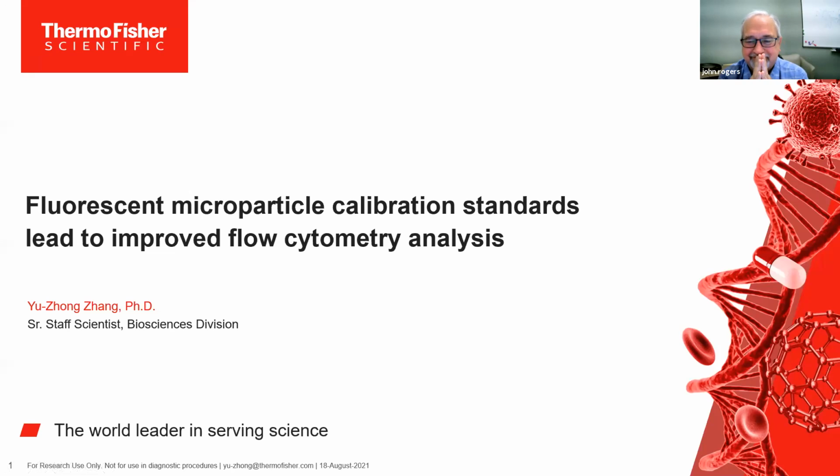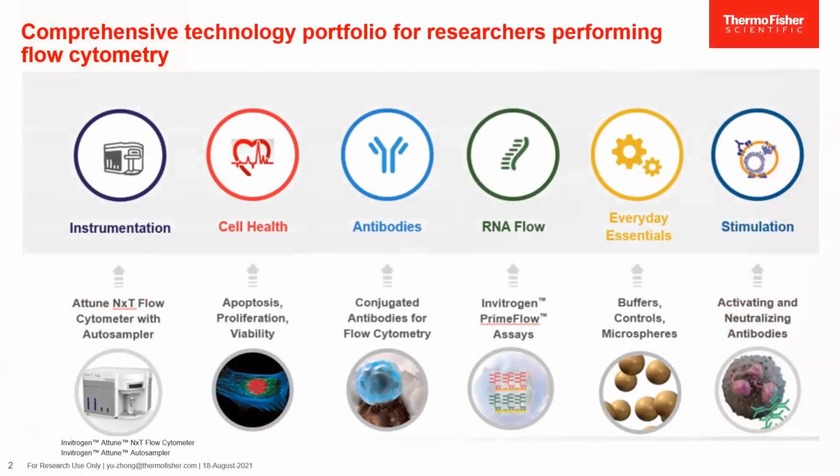By the way, I really enjoyed Professor Jasti's talk. I'm glad that I have another colleague working on non-biological nanoparticles. My talk today is also on non-biological particles, but slightly bigger. It's micrometer size, and we use it as a calibration standard to improve the data of flow cytometry analysis. So let me go quickly.